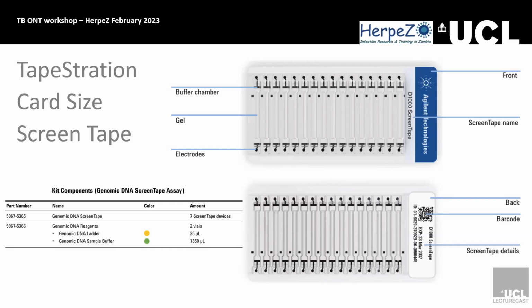At various stages, it's important to identify size and quality. Quality of your DNA. So throughout this, before you even put your samples into an Illumina or nanopore, you want to see if you've got nice DNA in the first place. But then afterwards, if you're pooling your samples, you might also want to check, certainly with Illumina, what sizes you've got. With nanopore, it's less important.